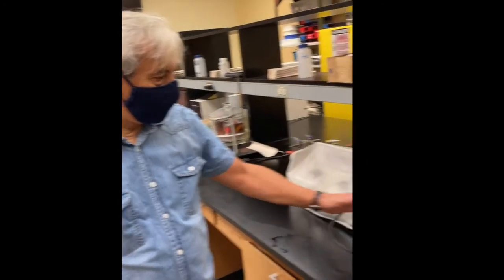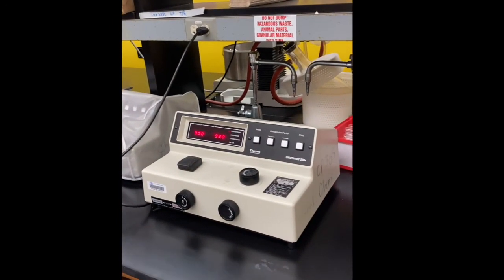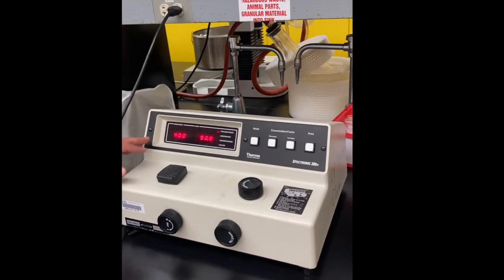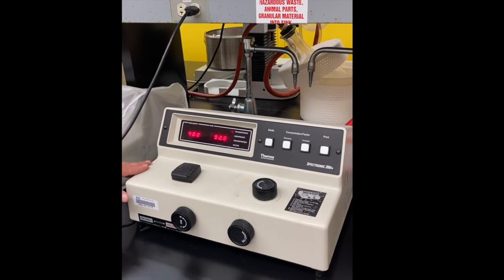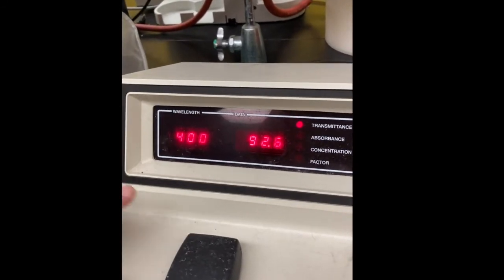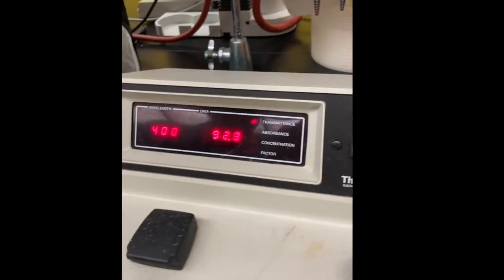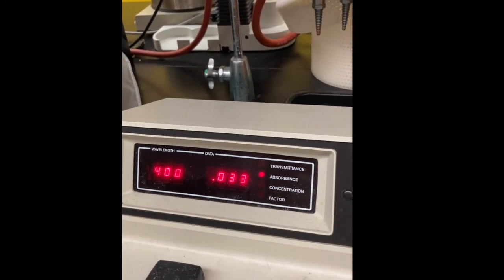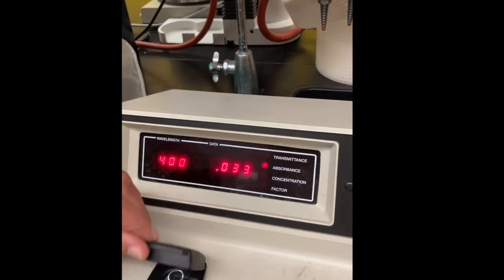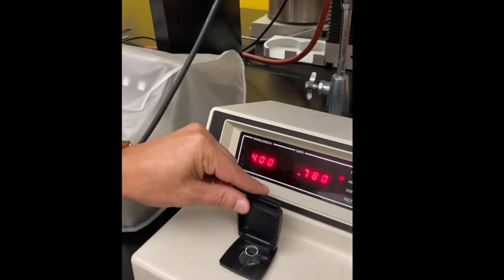Well, this is an old-fashioned but rather reliable UV-visible spectrometer, and we can set it up for particular wavelengths. So you can see now the 400 nanometer wavelength is set up, and we can switch between transmittance and absorbance mode. We will work in absorbance mode when we put our cuvette with the sample inside the spectrometer. So the cuvette goes here, we close it.